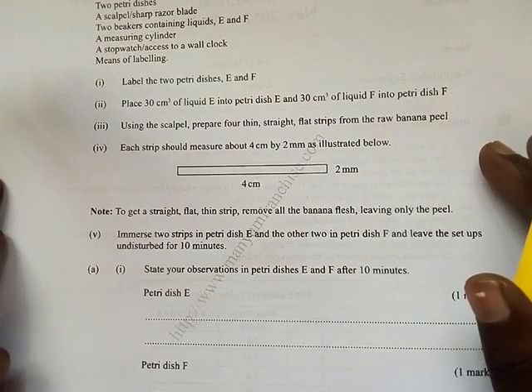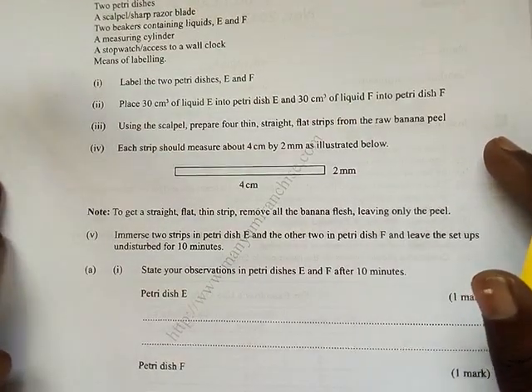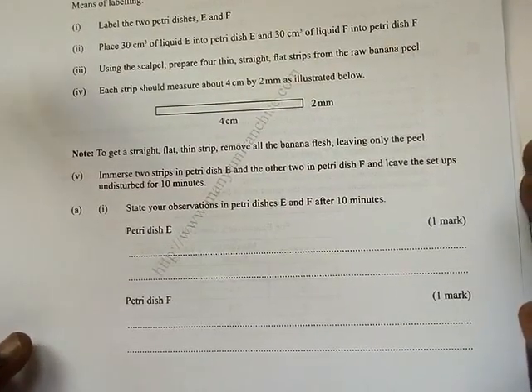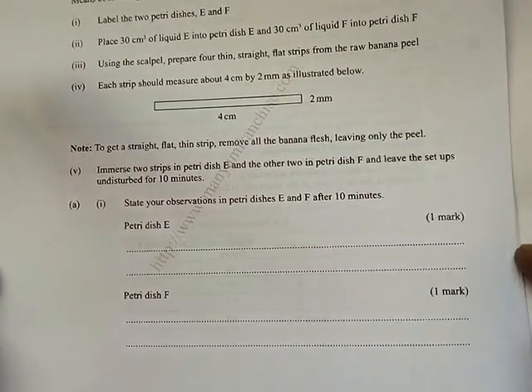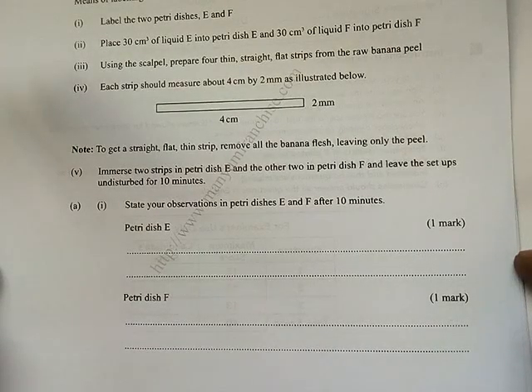centimeters cubed of liquid E into petri dish E, and 30 centimeters cubed of liquid F into petri dish F. Using a scalpel, prepare 4 thin, straight flat strips from the raw banana peel. Each strip should measure about 4 cm by 2 mm as illustrated. Now you are given a note. If you want to get a straight flat thin strip, remove all the banana flesh, leaving only the peel.